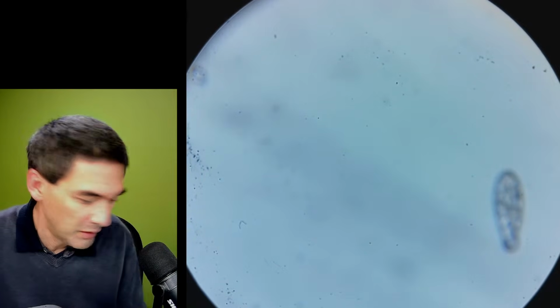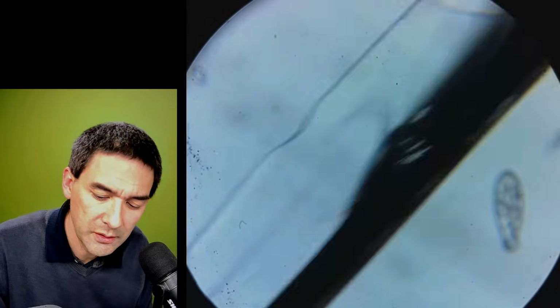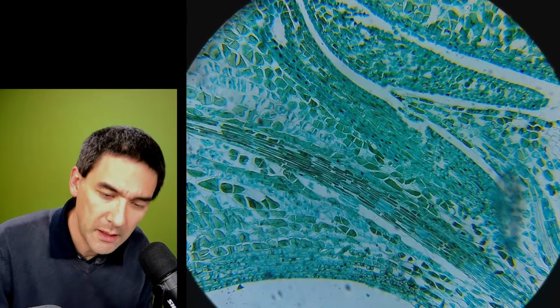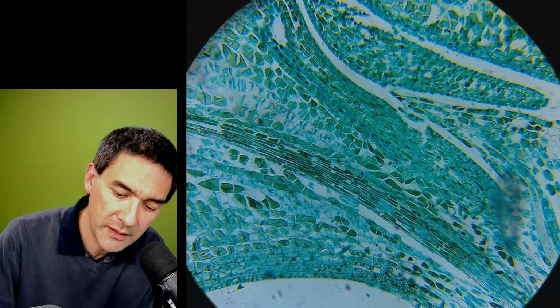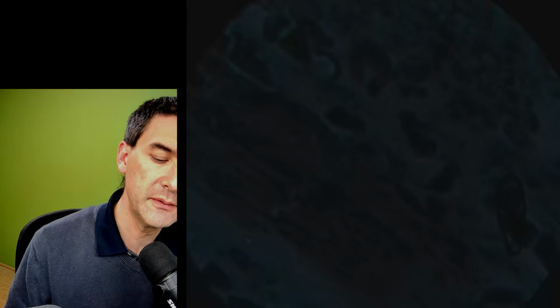Yeah. So, what was I just saying? Yeah, here we go again. So let's try a larger magnification. You see, the phone always goes into standby, which is of course not so cool.